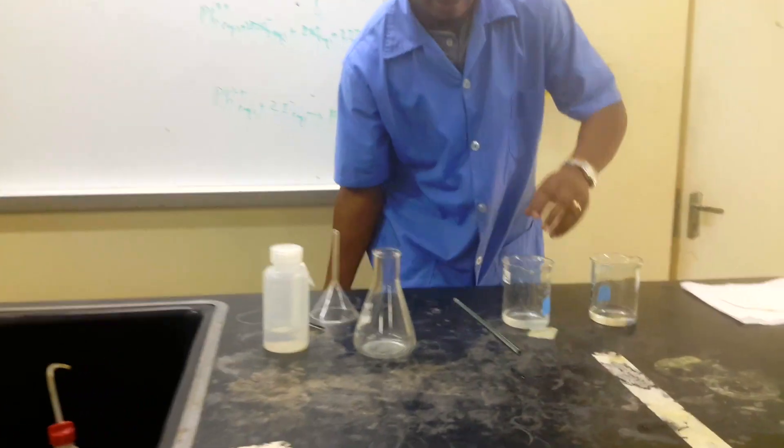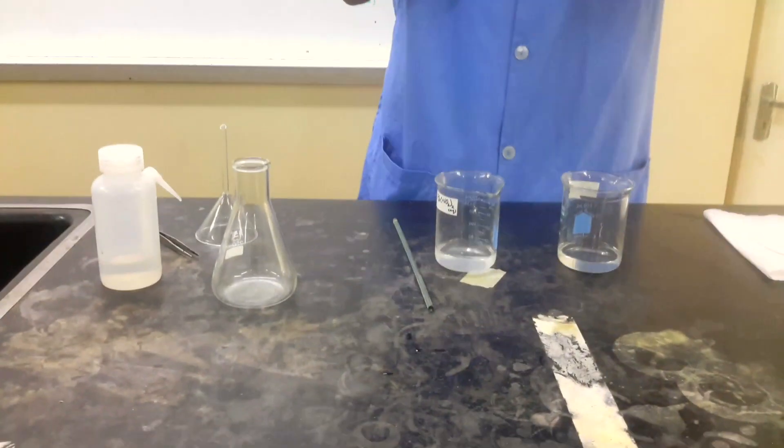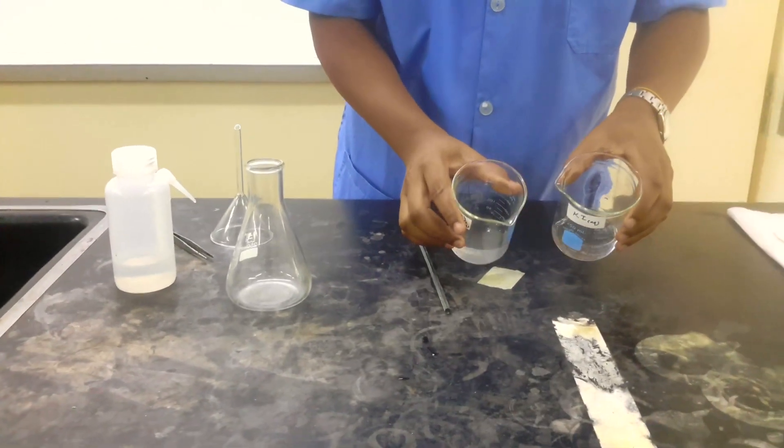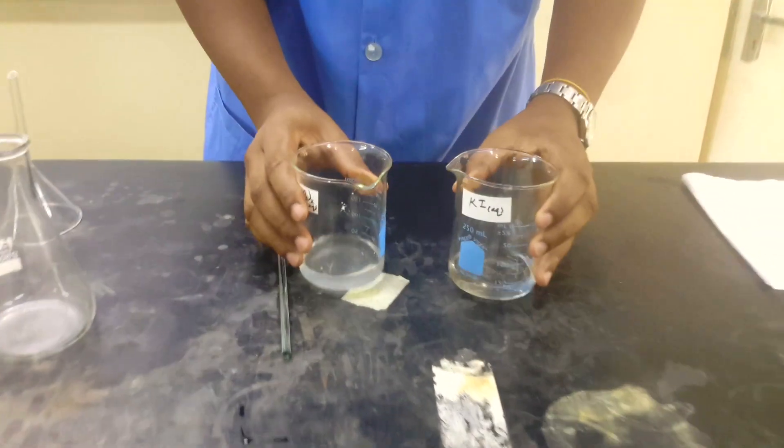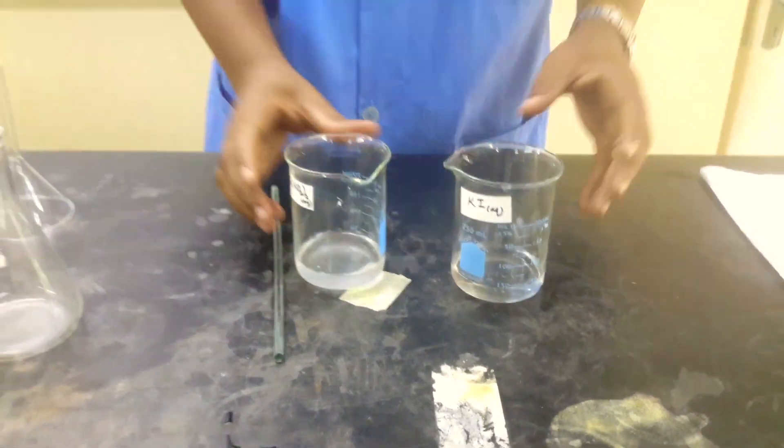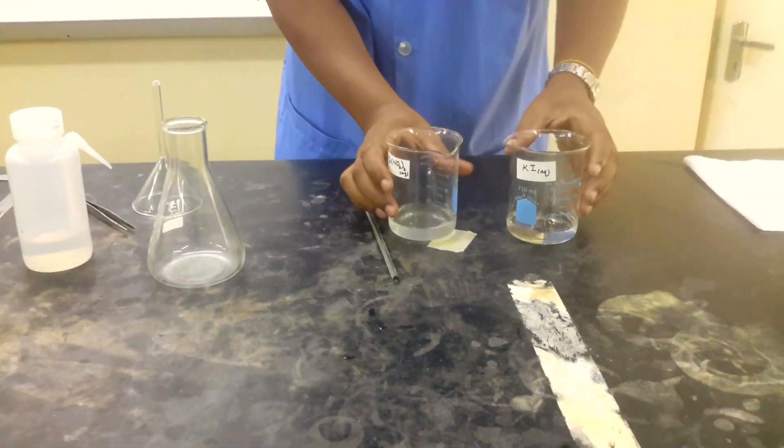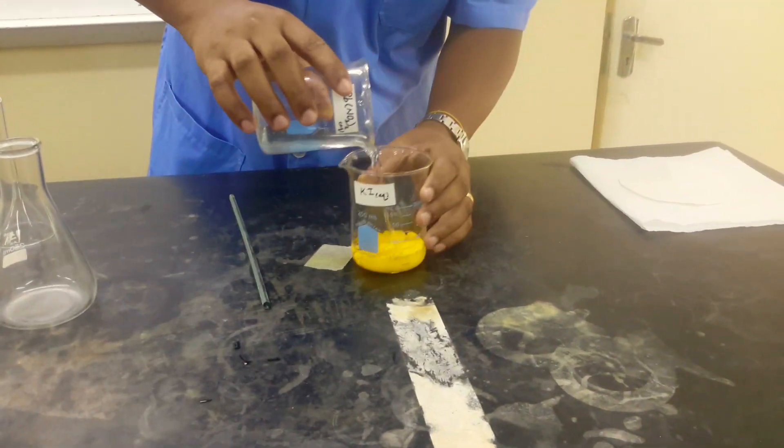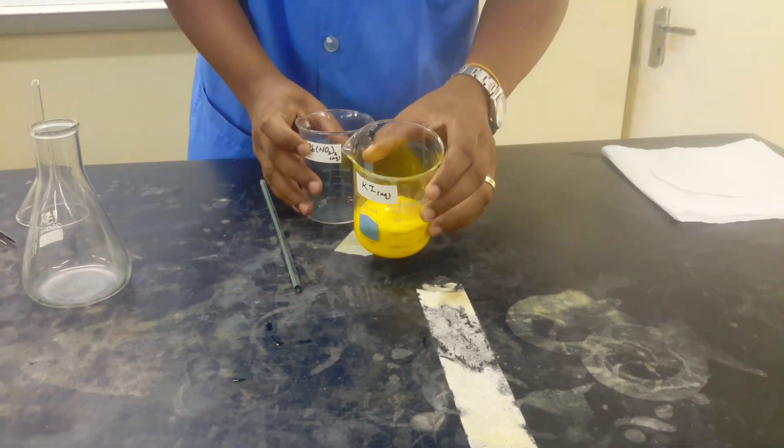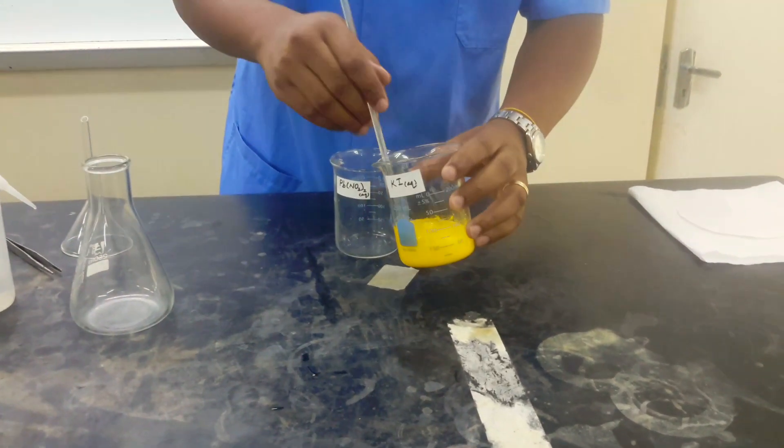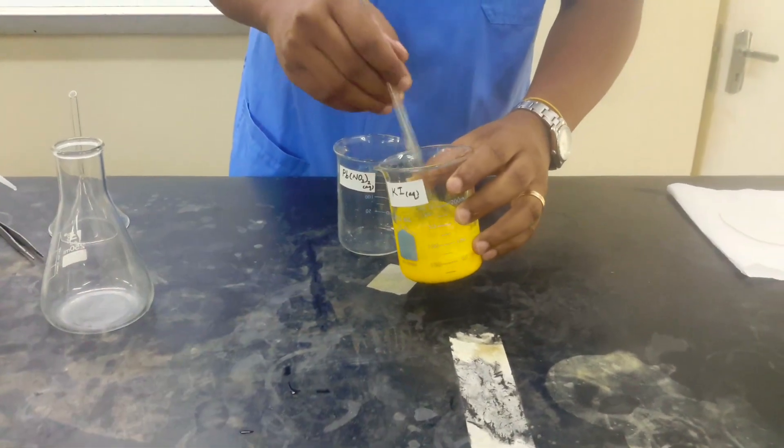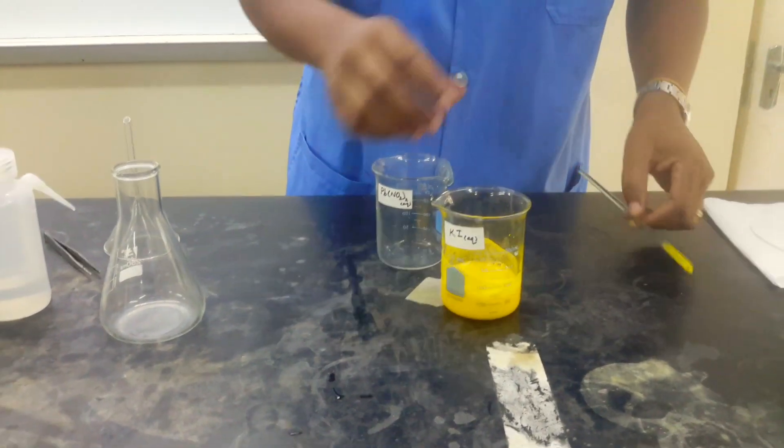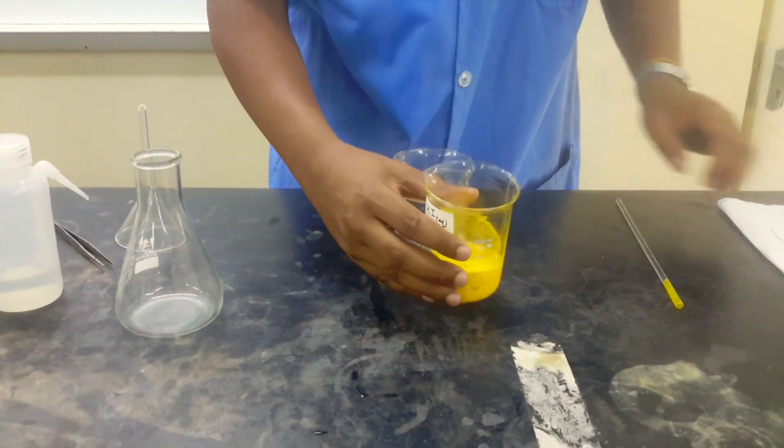So we have our lead nitrate and we have our potassium iodide solution. Both of them are colorless liquids. So all we're doing is just pouring one into the other. We're just going to add the potassium iodide to the lead nitrate. Voila, this is what we end up with.